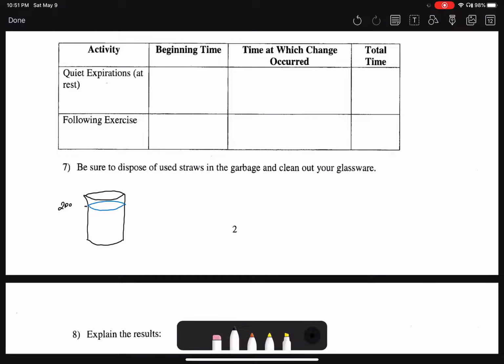With 200 milliliters of water, approximately. And then we're going to add 10 milliliters of sodium hydroxide solution. As a result of this, we now have a basic solution, or an alkaline solution, because sodium hydroxide is a powerful base. So now we have 200 milliliters of a nice basic solution of sodium hydroxide.